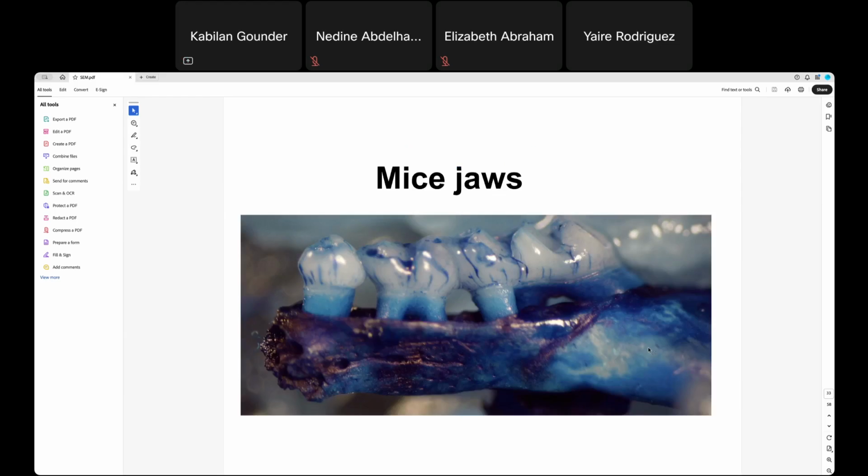So far we discussed the scanning electron microscope and the process. Why do you need to use the scanning electron microscope, what features can you see, and does every sample need scanning electron microscopic observation? Some of the experiments which we carried out in our lab were done with both light microscopy as well as scanning electron microscopy.